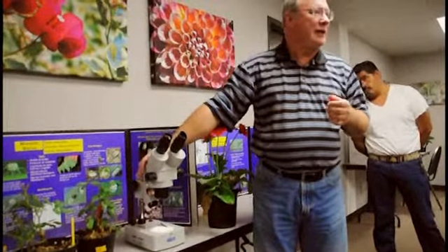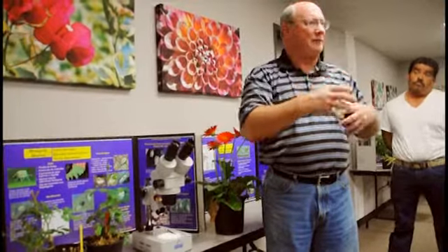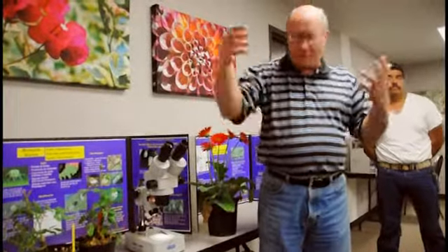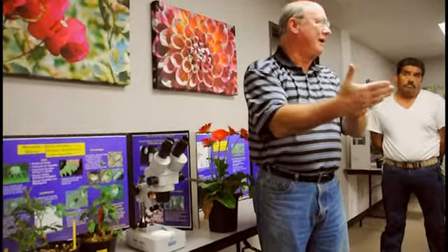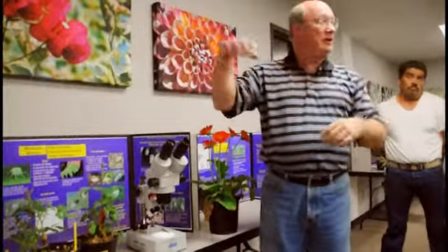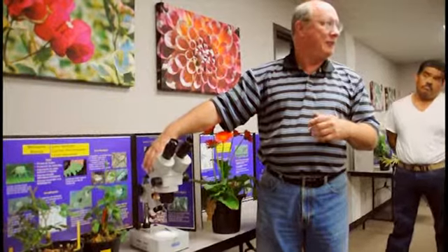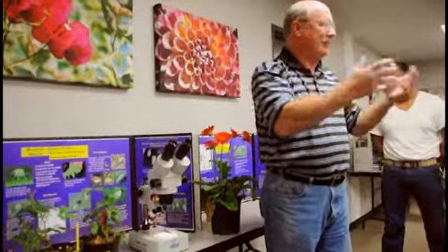The reason why it's your best friend is that a lot of the things you're going to look at are very, very small. And not only that, if let's say you found the pest and you spray it, and now you want to know if it's still alive, well, the microscope will tell you. If you look at the plant and you still see the bug, you don't know if it's alive or dead half the time. So this will tell you. And I know that Lucia also mentioned the wasp that killed the aphid. Well, you can see if it's the good guys, or the beneficials, that are actually feeding on the bad pest or the pest insect by looking at it under the microscope, rather than just guessing out in the field.